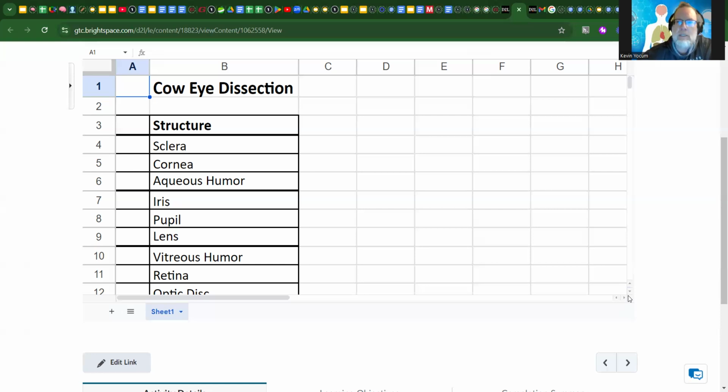We'll get to see some separation of the fibers. So we'll pay attention to fiber direction. We'll even separate a little bit some of those muscles as we're removing them. So you can see the intricacies of how skeletal muscles work.